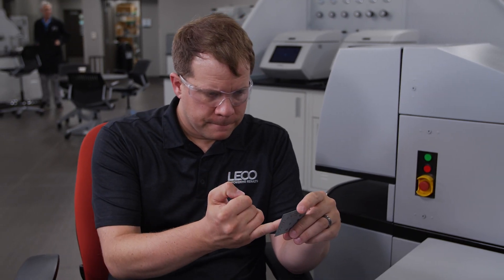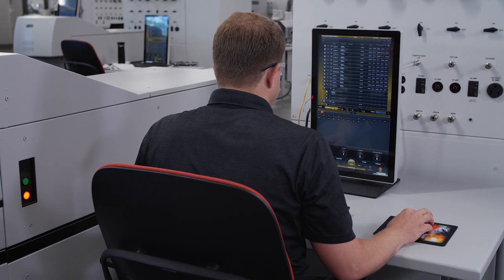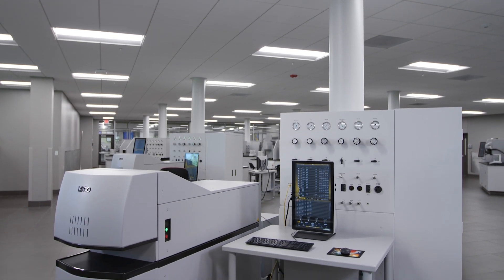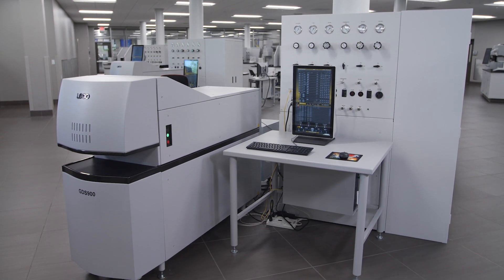Whether your needs for bulk elemental or compositional depth profile analysis are driven by the need for superior analytical precision or the flexibility to change from matrix to matrix without metallurgical sample history, the Cornerstone GDS systems can maximize your laboratory's efficiency.